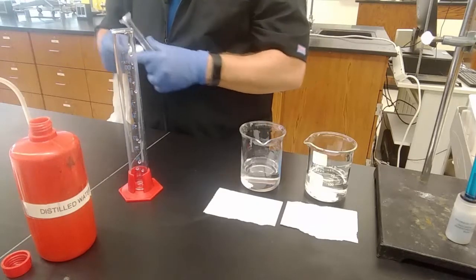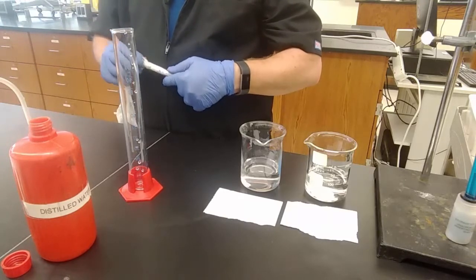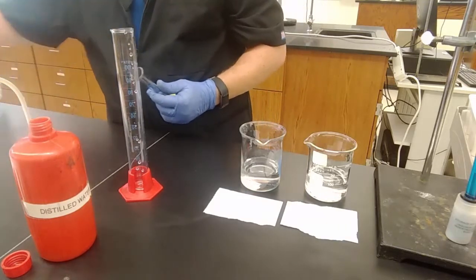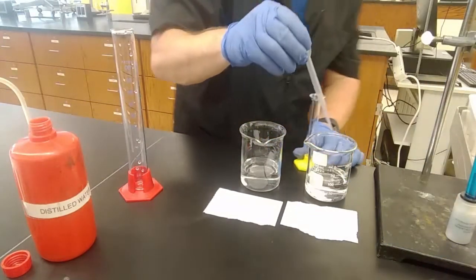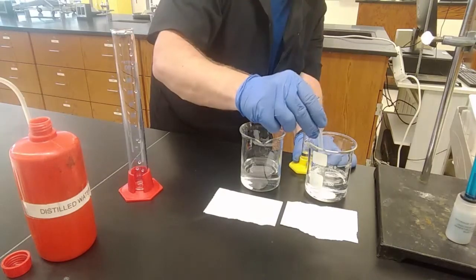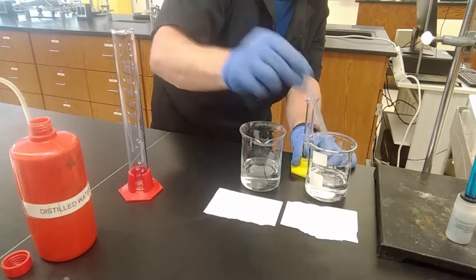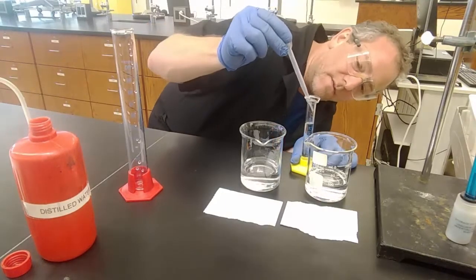Get that a little bit drier. Going for relatively good precision here. And I want 10 milliliters of the 0 solution. Eye level.